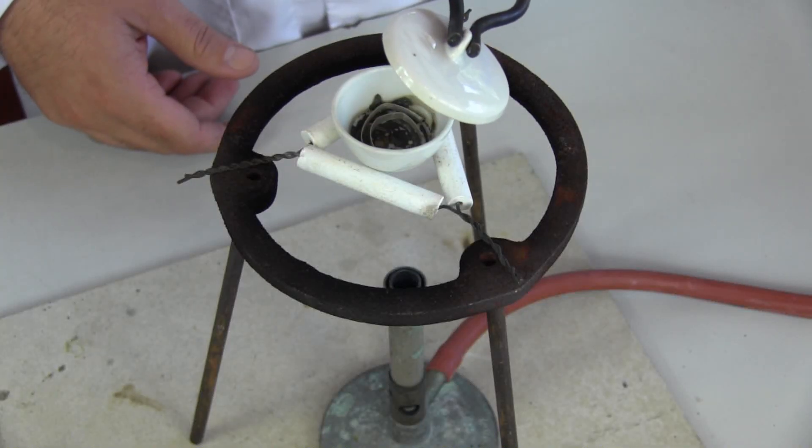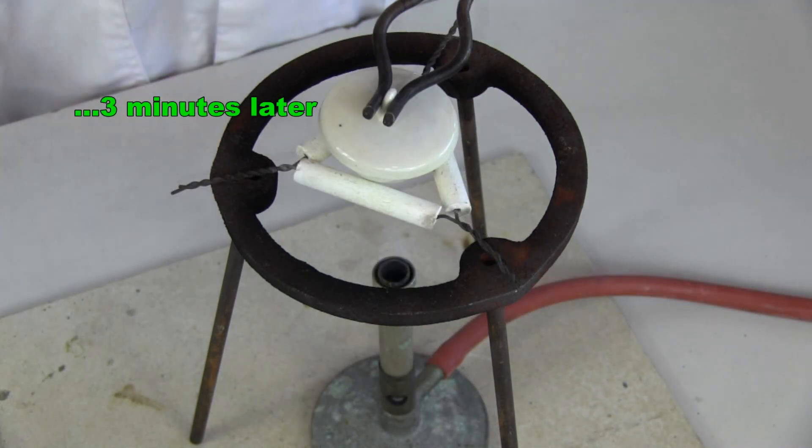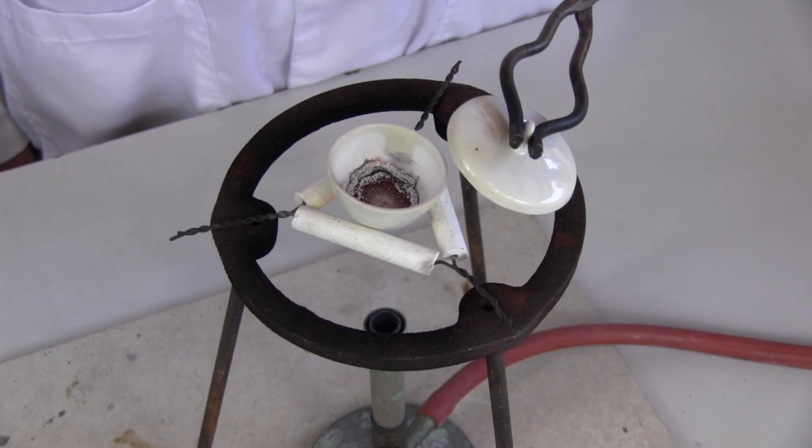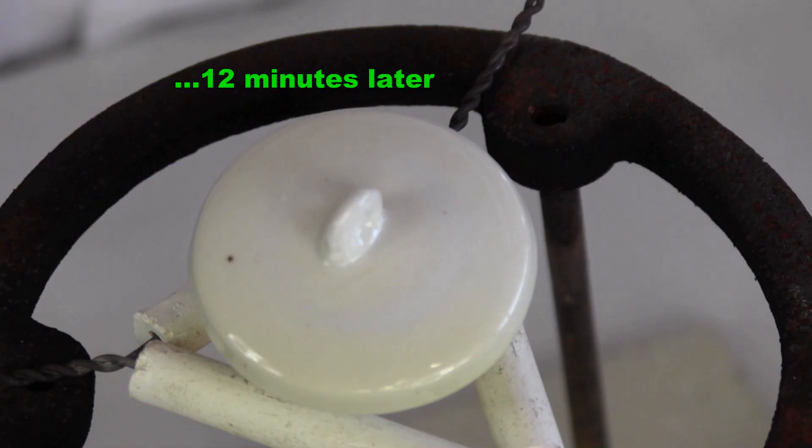If we heat the magnesium in the crucible, it eventually starts to burn. By placing the lid on the crucible, we can slow the burning process and limit the amount of smoke that escapes.